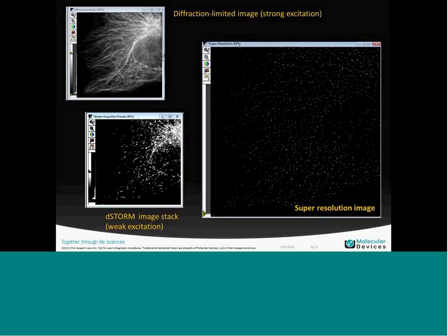Through clever physical manipulation using photoactivation or photoconversion or internal conversion, a very limited number of molecules are allowed to fluoresce, while the rest is inhibited from doing so. You'll see the visual punctate footprints: 20 to 100 single molecules out of millions. These are not adjacent to each other due to the probabilistic nature of their activation. The point is that they should be separated enough so that their localization can be achieved.